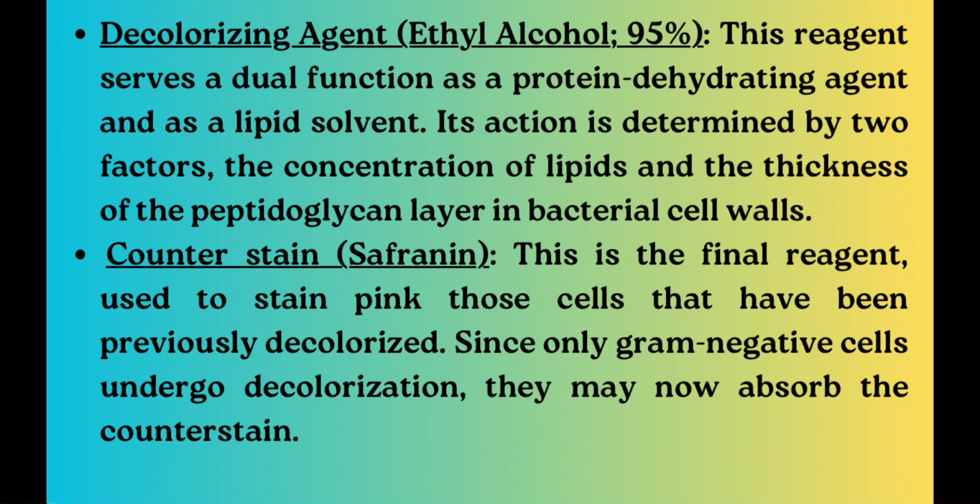Counterstain, safranin. This is the final reagent that is used, and it stains those cells that have been previously decolorized pink in color. Since only gram-negative cells undergo decolorization, they may now absorb the counterstain.